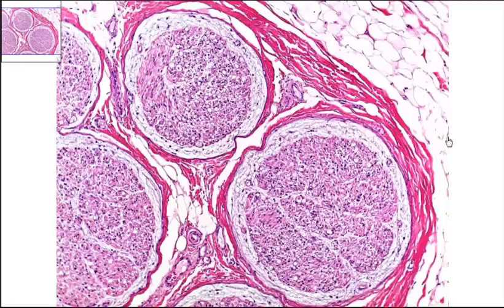What we can see in this view is the most outer edge of the nerve. That means this connective tissue covering is going to be the epineurium.